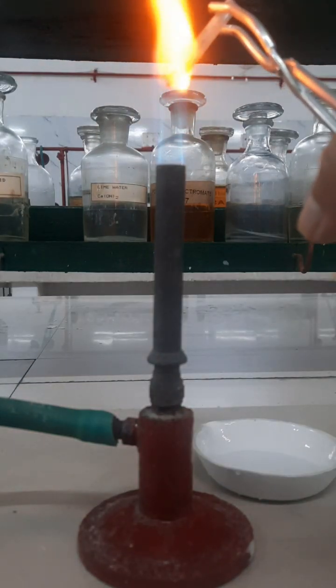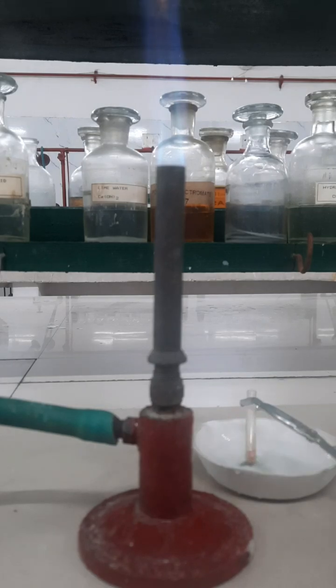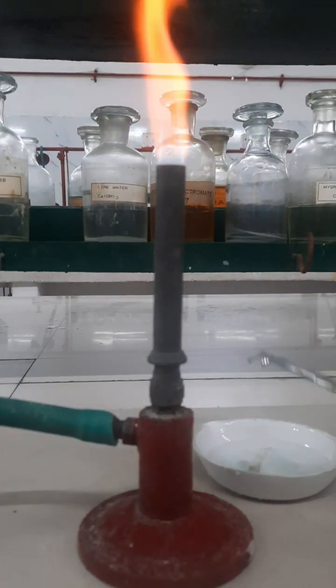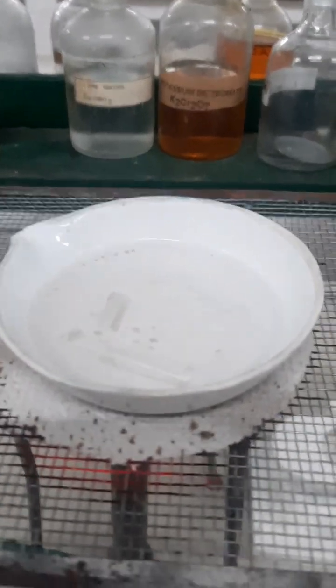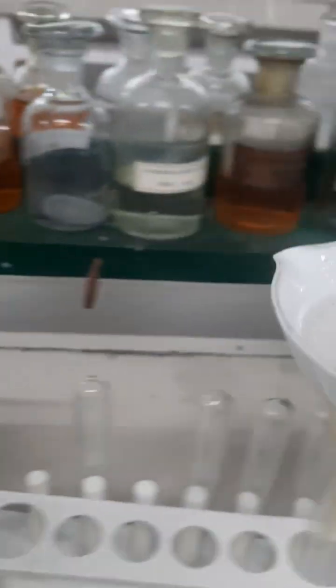Then I am heating strongly and transferring this hot ignition tube into the china dish containing a few ml of distilled water. Boil the content over the burner and filter it with the help of funnel and filter paper.